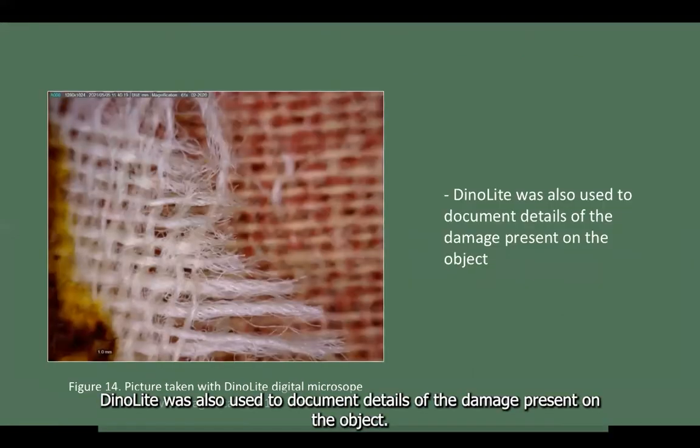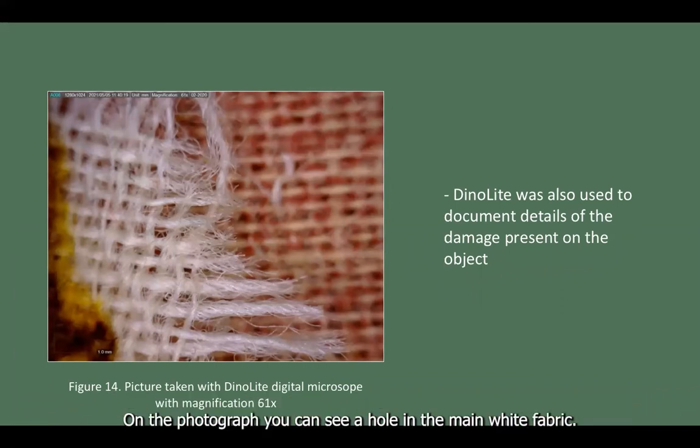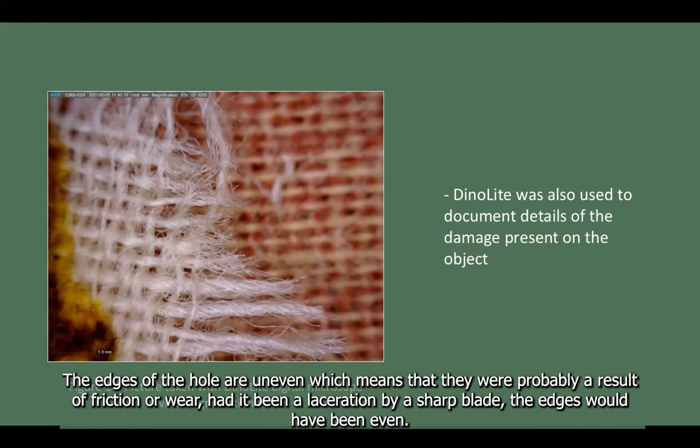DinoLite was also used to document details of the damage present on the object. On the photograph, you can see a hole in the main white fabric. The edges of the hole are uneven, which means that they were probably a result of friction or wear. Had it been a laceration by a sharp blade, the edges would have been even.